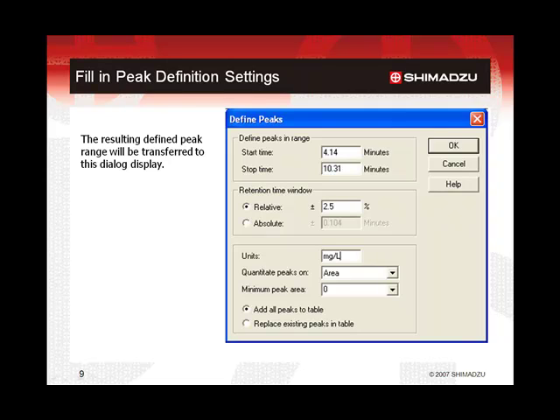Once the peak range has been defined, a dialog display will appear showing the time points used to define the start and end points of the range. In this display, it is possible to make a selection for the setting of the retention time window. The relative window selection sets the retention time leniency to a plus/minus percentage of the peak retention time, which will calculate retention time windows that steadily increase in width. The absolute window allows selection of a fixed plus/minus time range that would, by default, apply to all defined peaks.